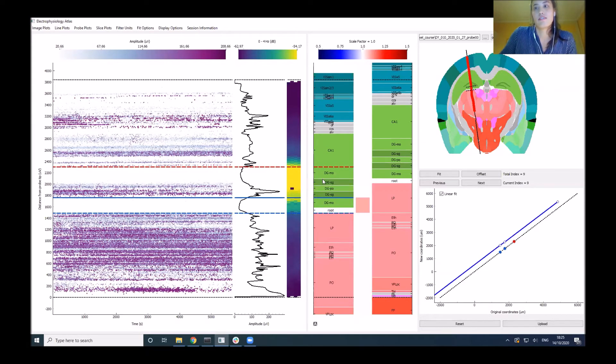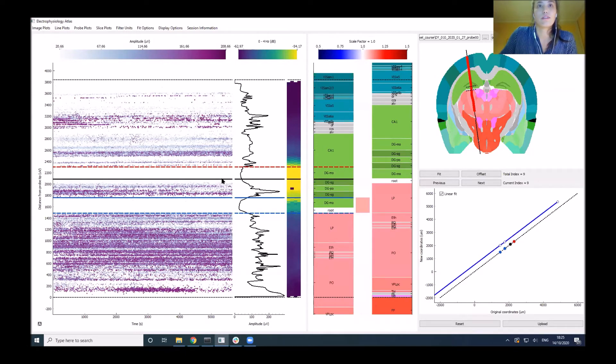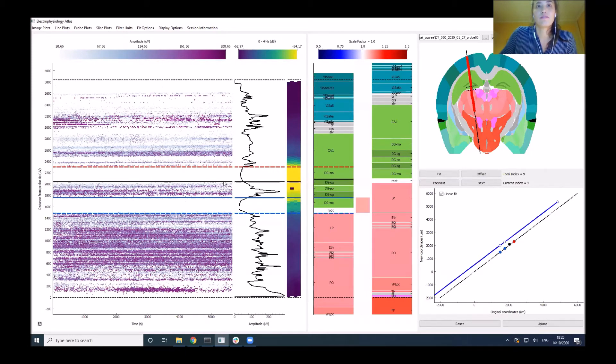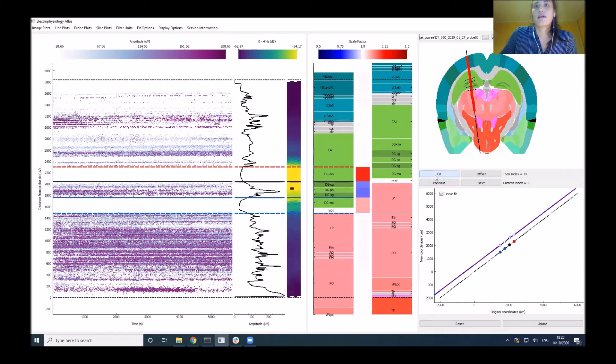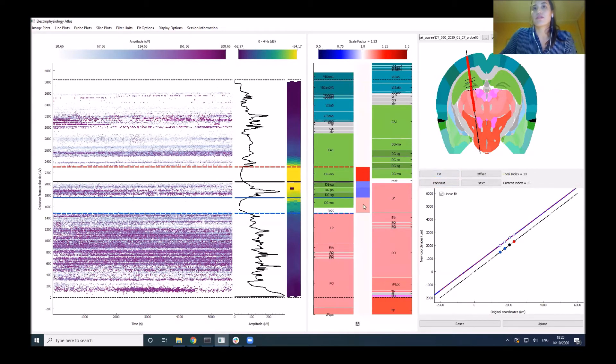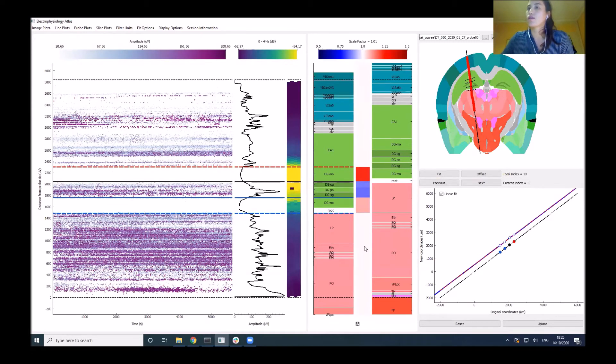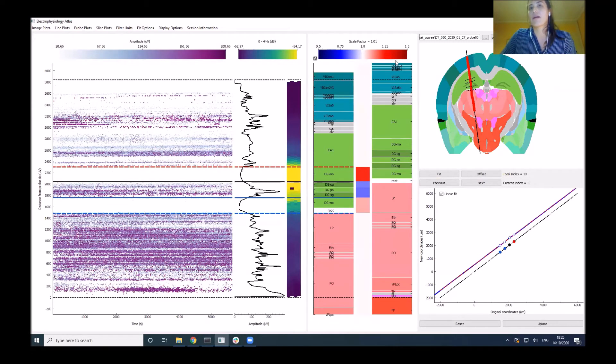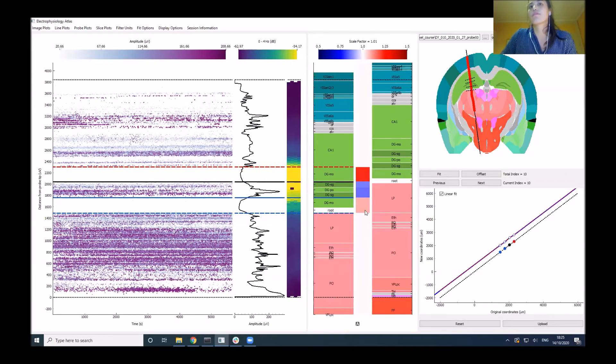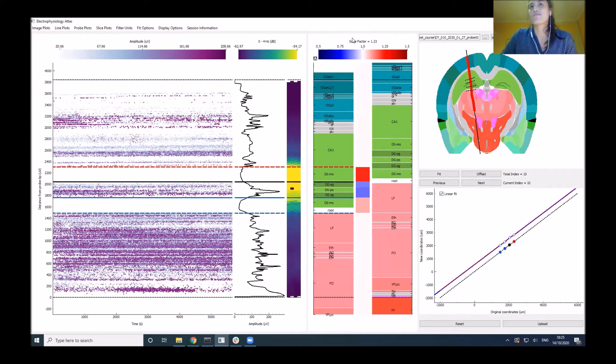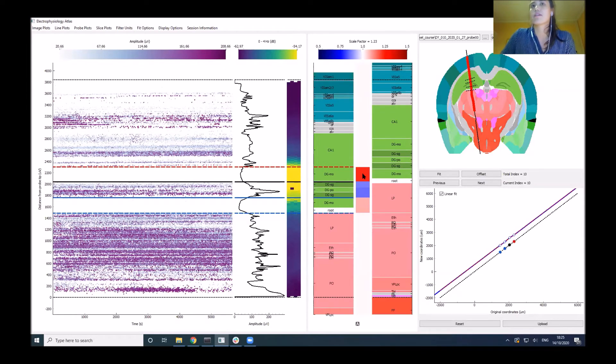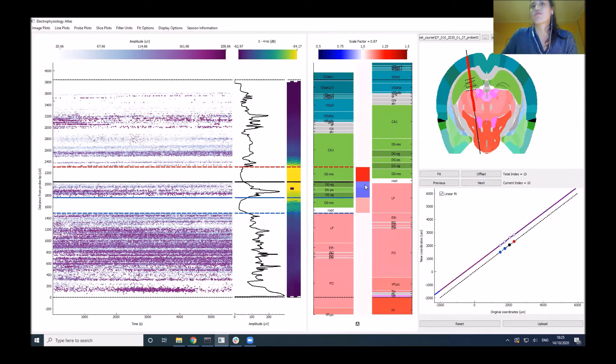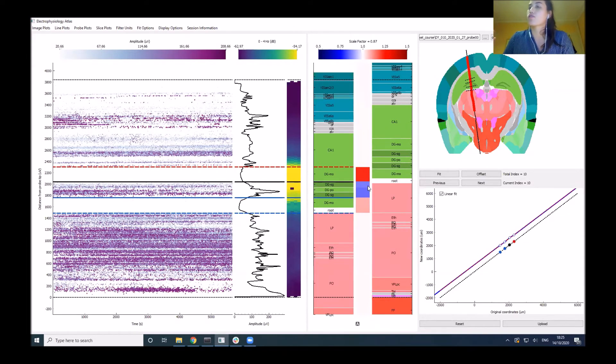We can see the scaling factor. This central comment shows the scaling factor we've applied locally to all the regions, shown as a heat map with a color bar here. You can hover over a region and in the title it will tell you the scale factor applied locally to that region. In this case, we've stretched that by 1.23 and the one below we've compressed by around 0.9.